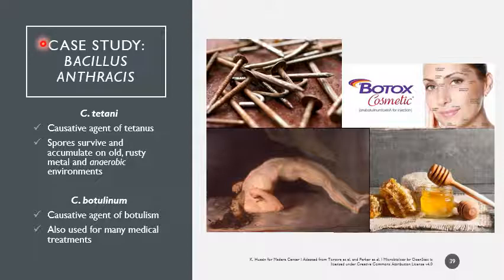Oh, I realize there's a typo here. This should not say Bacillus anthracis. I was trying to keep the formatting consistent. This should say Clostridium. So sorry about that, but this is another genus of bacteria that produces endospores.